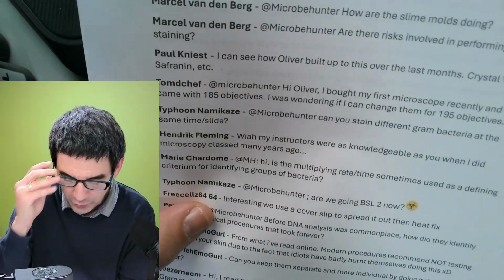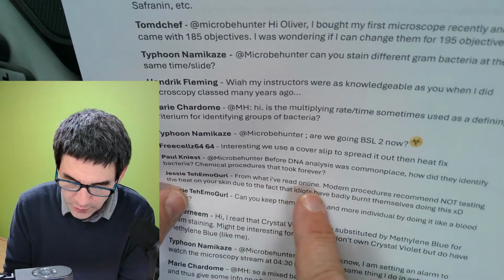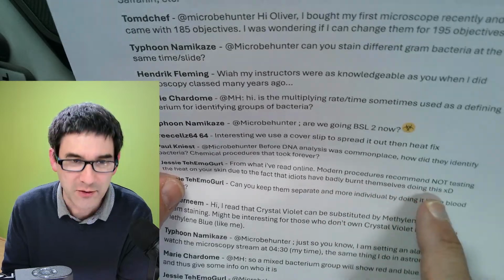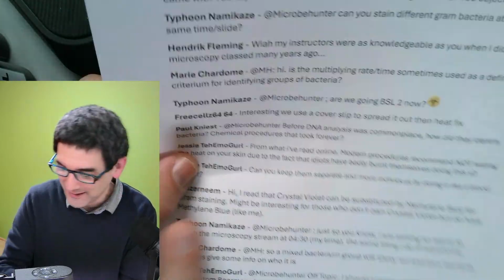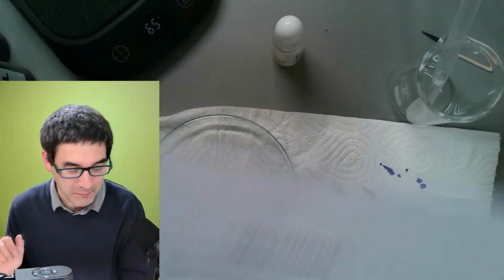I need to put on my reading glasses. DNA, I talked about this one. From what I've read online, modern procedures recommend not testing the heat on your skin, because idiots have badly burnt themselves doing this. Oh my gosh, yes. If you just joined, this was kind of the test of whether the slide was sufficiently hot or not. But back to serious.